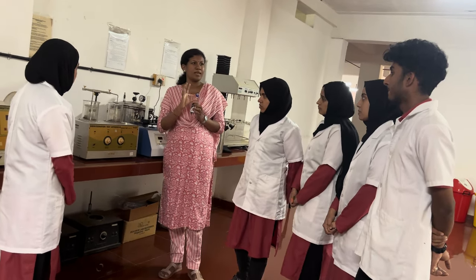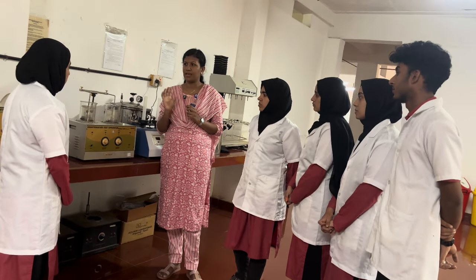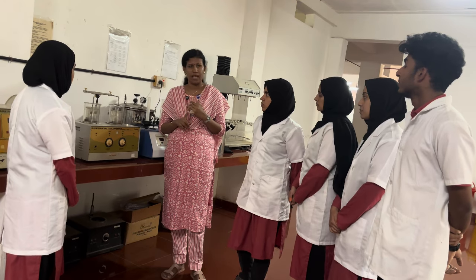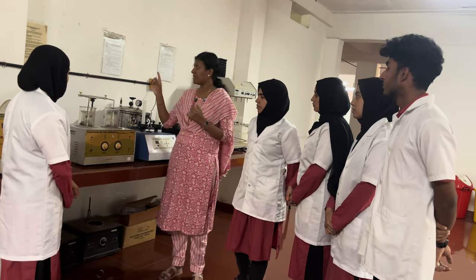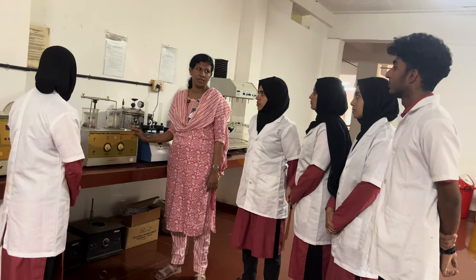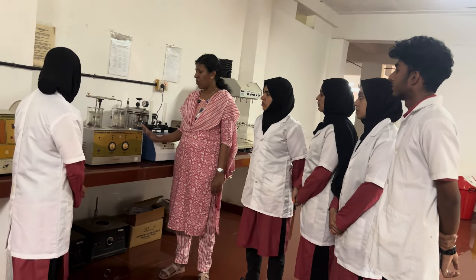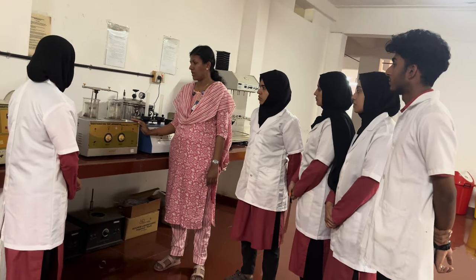We are measuring the disintegration time for tablets. What is the disintegration time for tablets? So we have prepared paracetamol tablets IP, and we have to evaluate the quality control set. You can see the SOP, the standard operating procedure for the disintegration apparatus, is displayed. Okay. So first we will go through the parts of the equipment, the disintegration test apparatus.